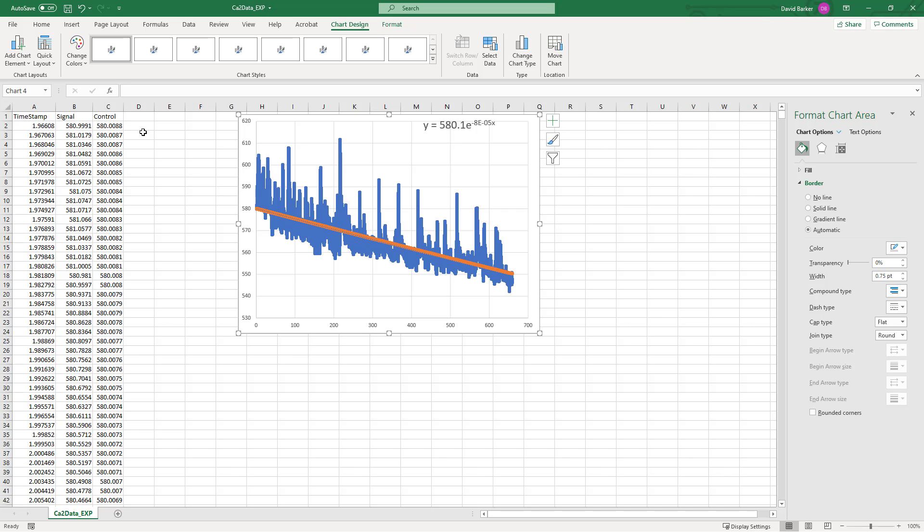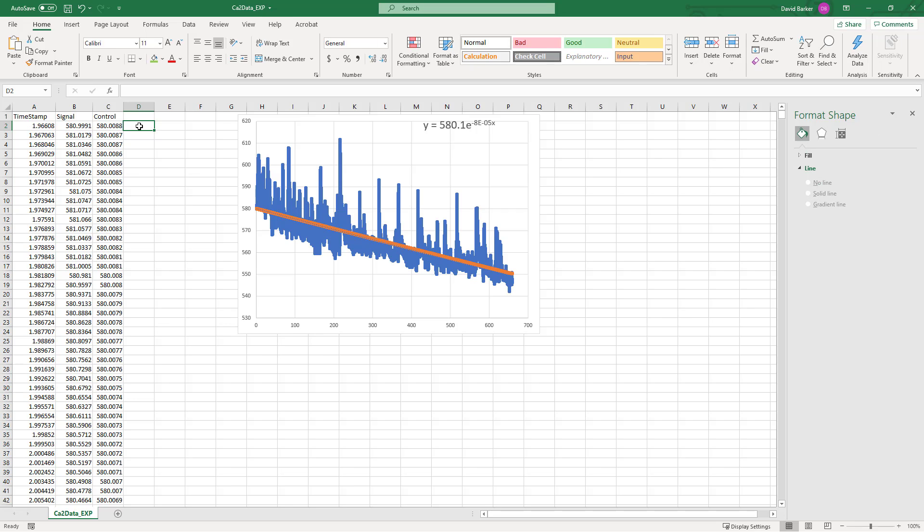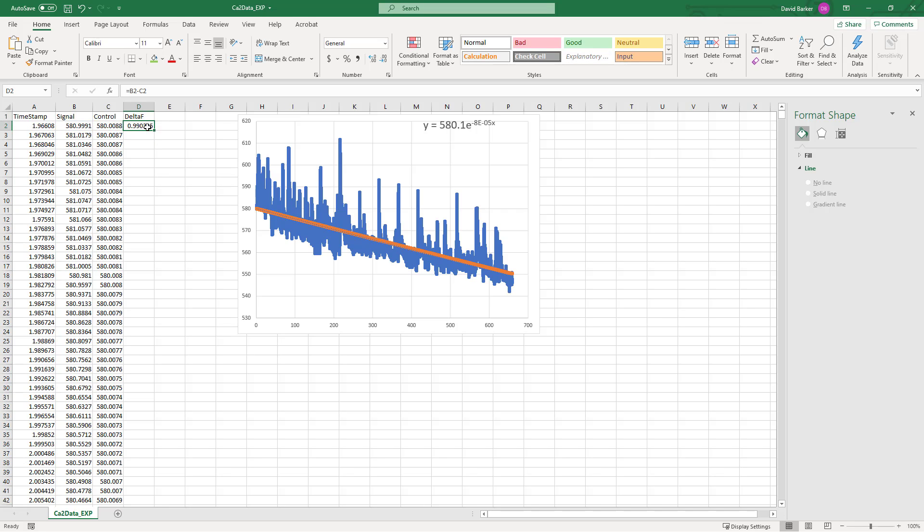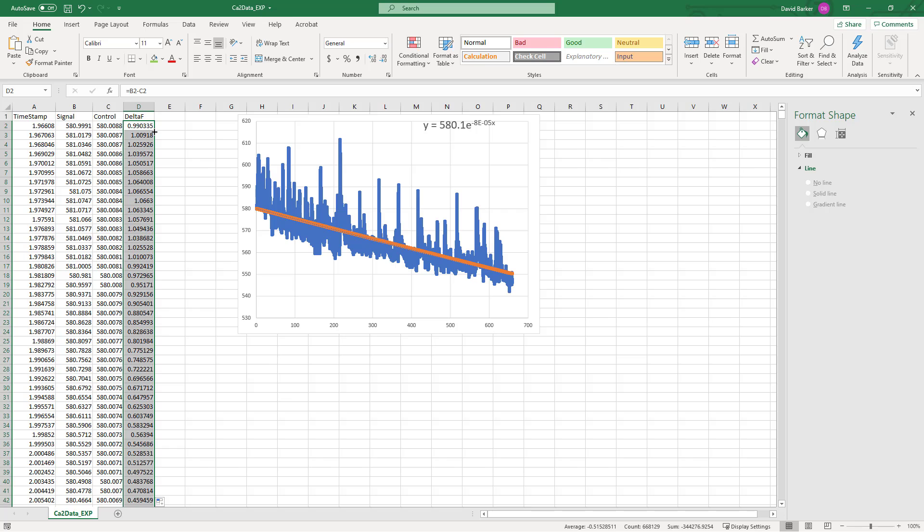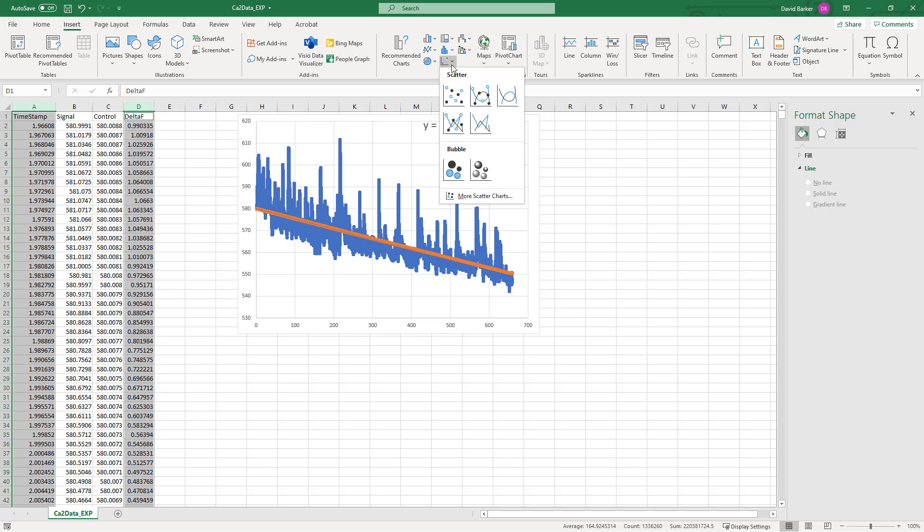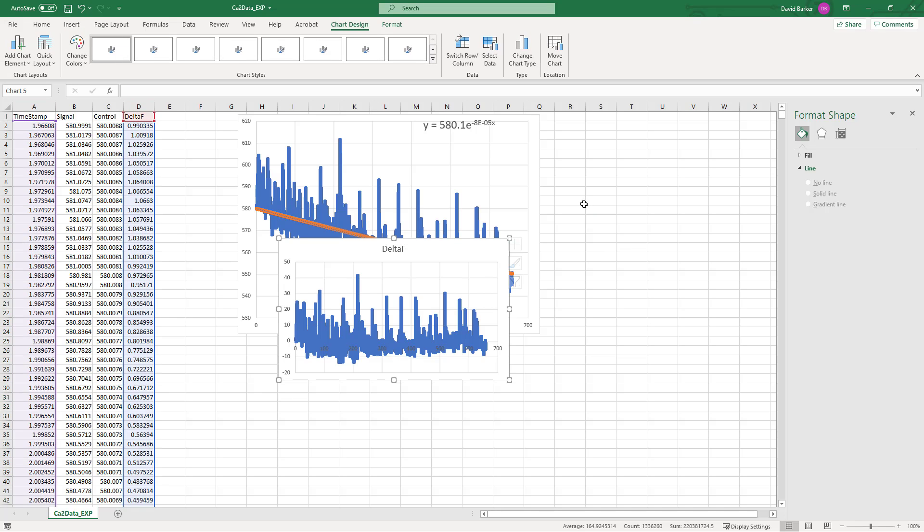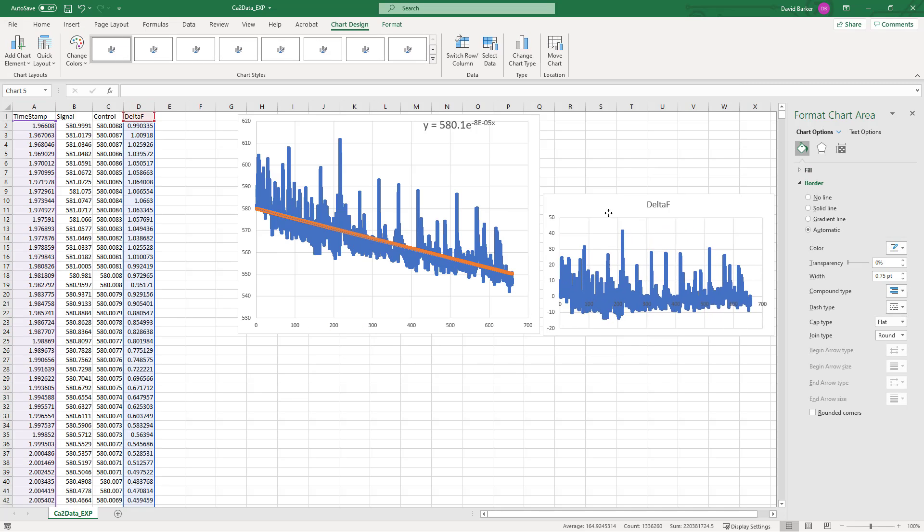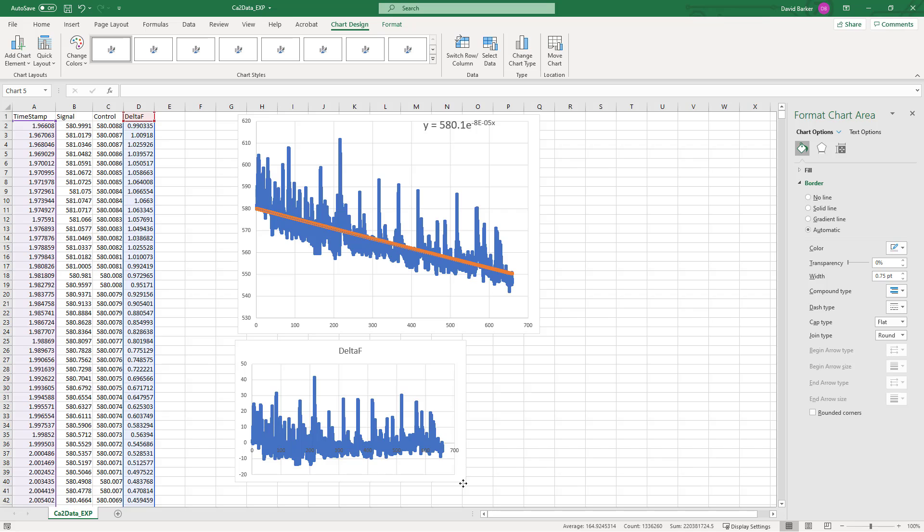If you want to see what your flattened curve would look like, you could easily just come in and create a Delta F column here. All you would do is you would take your signal data and subtract the corresponding control data. Then you can again use that double-click of that square to take this all the way down to the bottom. We can create an entirely new graph if we want to see this data, or we can look at the timestamp with this.